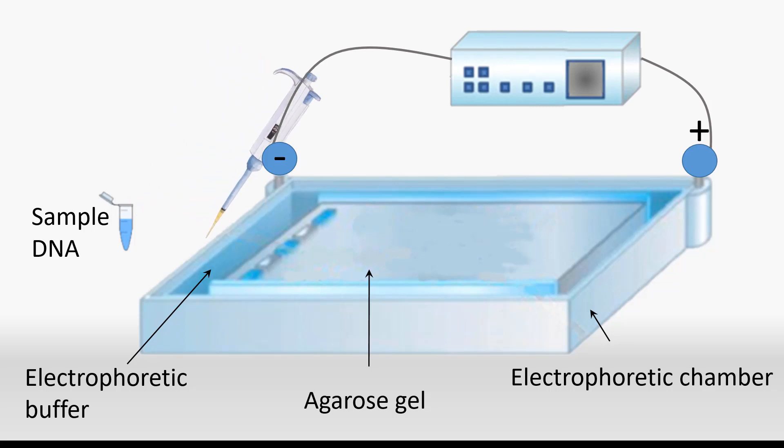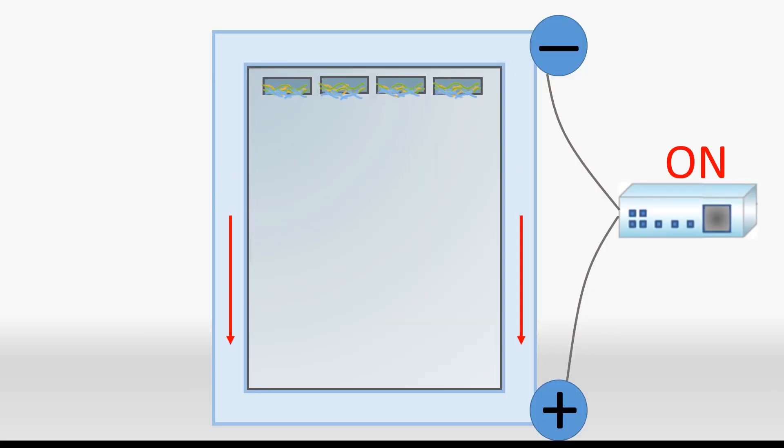The samples are loaded into the wells. At this point, the gel is ready to run and the power supply is turned on. With the current running through the buffer, the DNA begins to migrate through the gel.